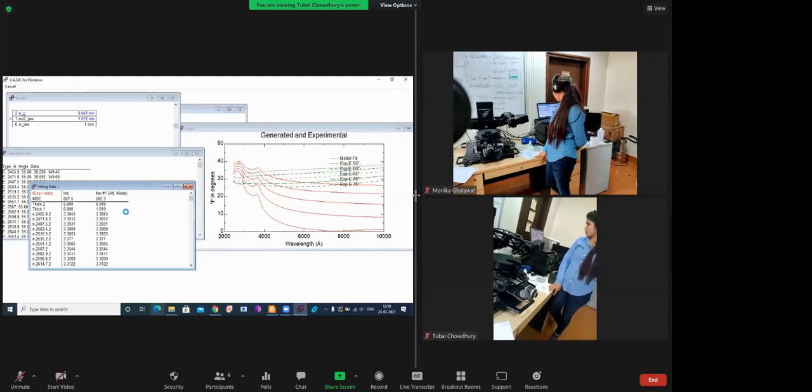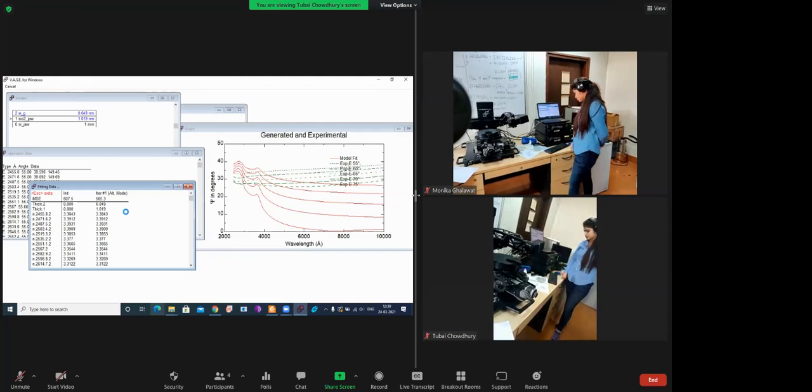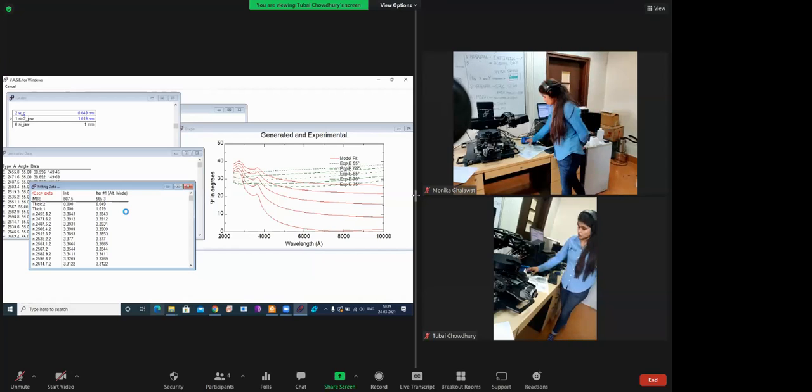That's why we are not getting proper information about this. It will take some extra time.